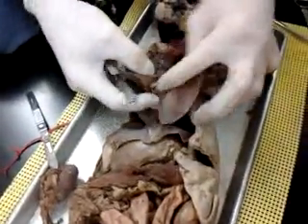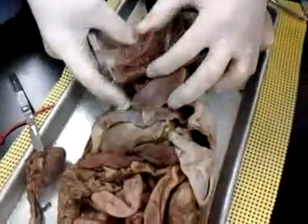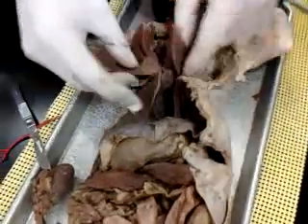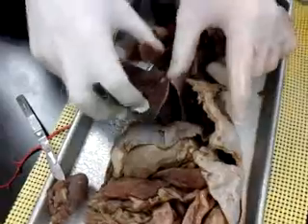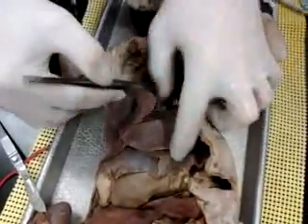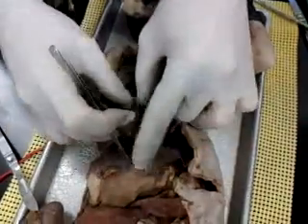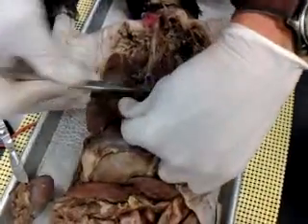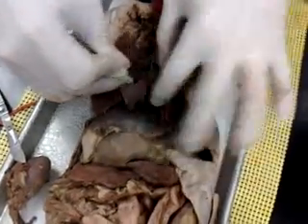So if you look, let's see, here's the right lung, 1, 2, 3, 4 lobes. Left lung has 3. But these are the individual lobes, a little bit more spread out in the cat than they seem to be in the human. Here's the trachea coming in. So you got one trachea coming down to both lungs, left and right lungs. So the trachea will split some of this stuff out.